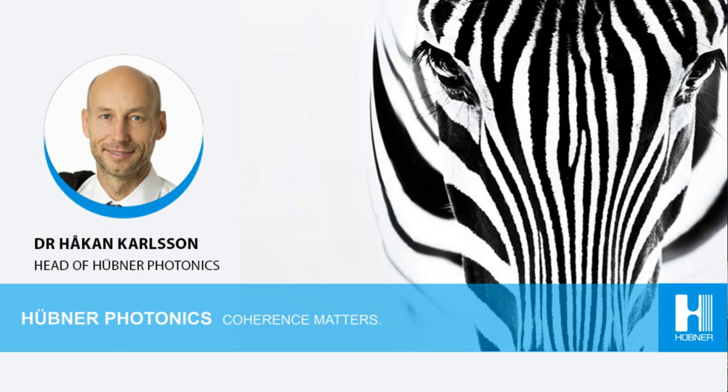But we also have possibilities to customize the beam characteristics. If someone wants to have a more divergent beam, to have a larger beam diameter before focusing the beam onto the sample, that's something we can customize.